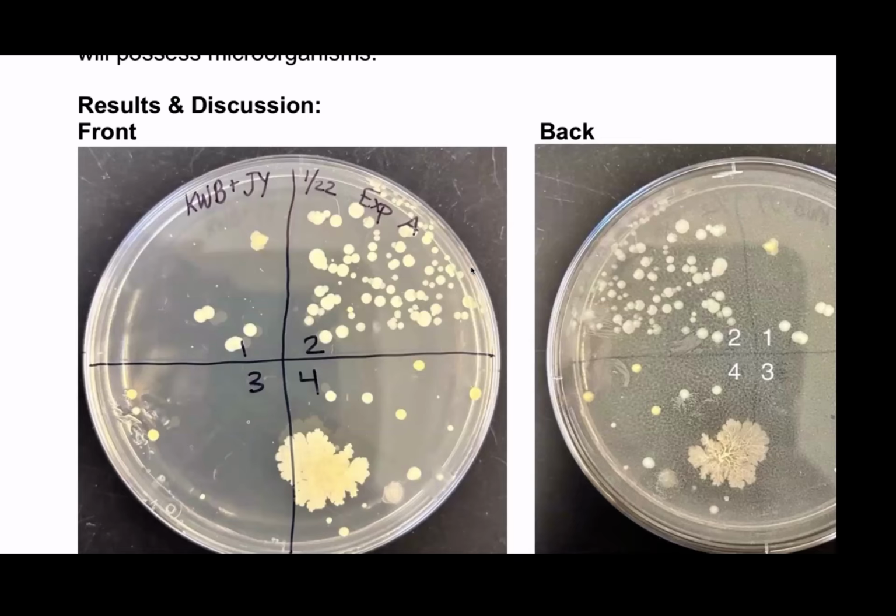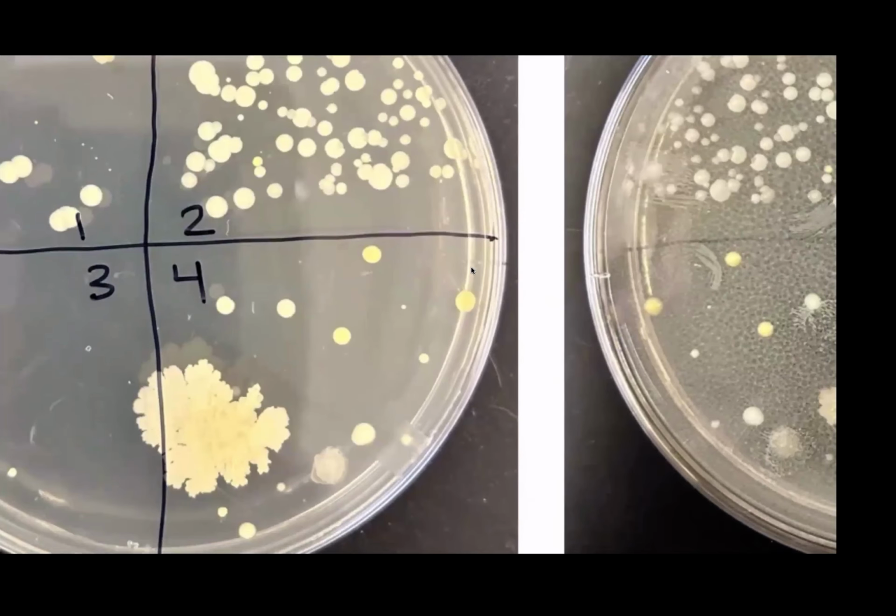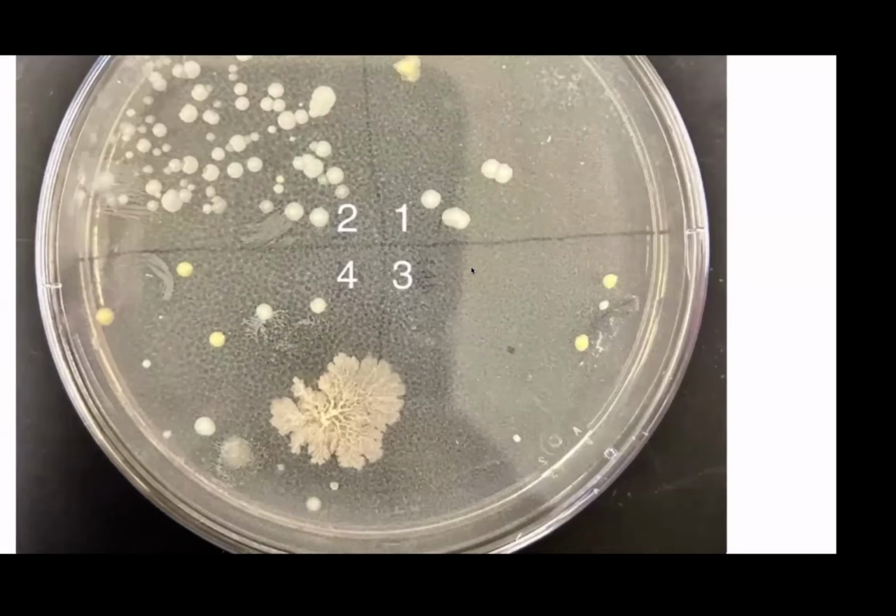This one looks similar. By looking at these bacteria, I can tell that they look similar because the type of colony, visually I see they are the same. The size is also the same, meaning they are dividing at the same time. But yellow and these are two different. This one is another one. Then some of them are coming very slow.